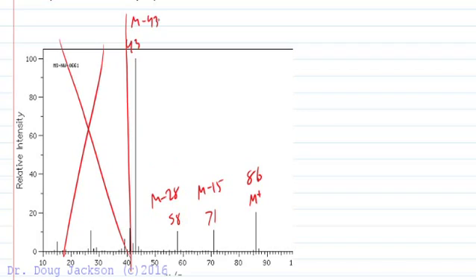So 43 less than molecular ion. When we diagram it, we diagram not only what mass it is, but we diagram what we lose from that mass. And then we can venture a guess that this is loss of methyl. That this is loss of ethylene here, 28. And for 43, we can run a series of options. 15 plus 14 is 29, plus 14 more would be minus a propyl group. So that could be loss of a propyl group right there.